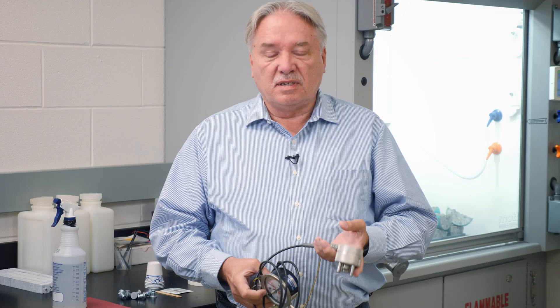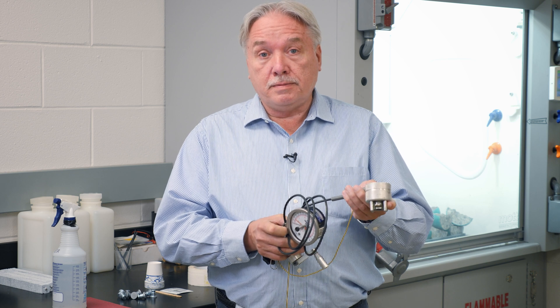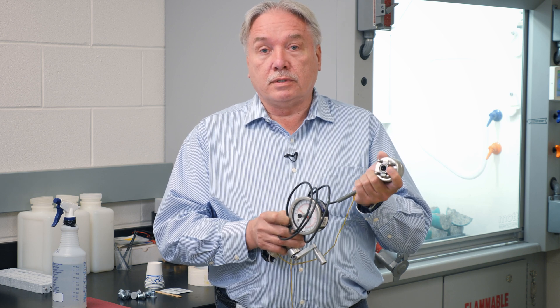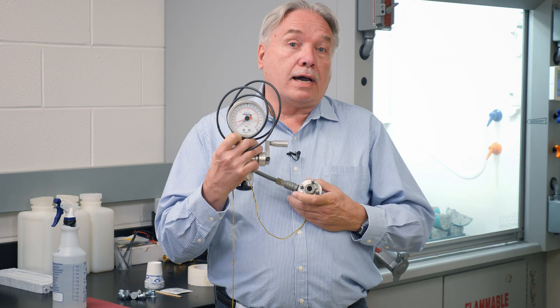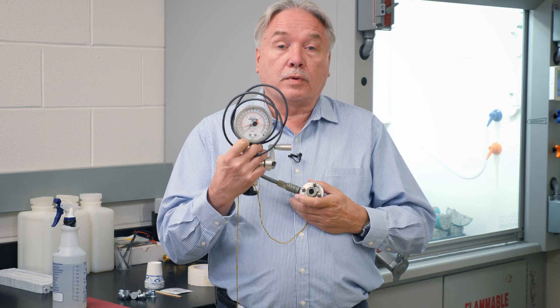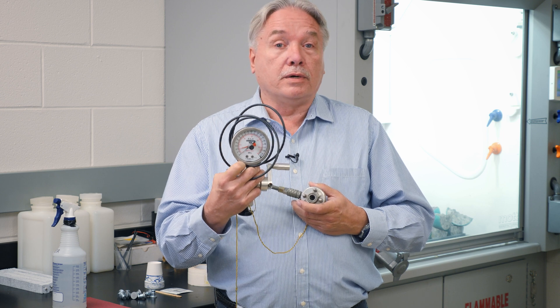This test device essentially consists of two components: the hydraulic testing head, which you use to attach to a test fixture, and a dial gauge in order to get a readout of the load that you're applying to the coating.